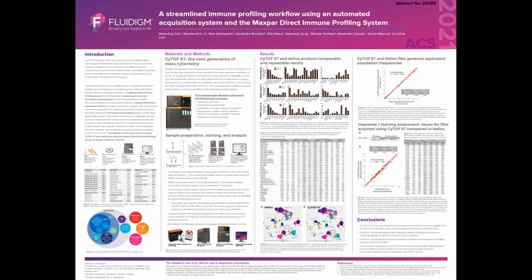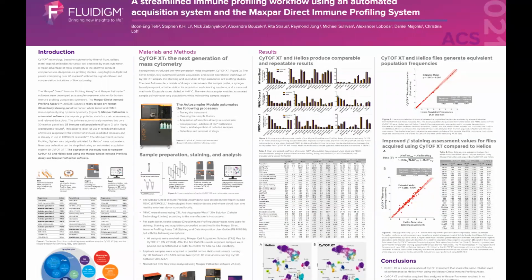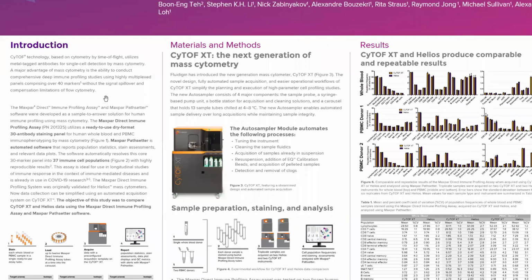Mass cytometry allows for highly multiplex single-cell analysis of more than 50 different protein markers simultaneously by using isotopically pure metal-labeled antibodies to stain cells and gain different marker expression information. A significant advantage of the CyTOF is the ability to resolve more than 50 markers in a single panel without the need for compensation, making mass cytometry an ideal solution for routine enumeration and phenotyping of immune cells.